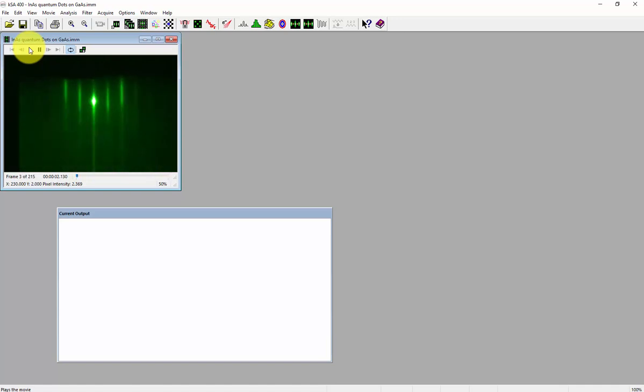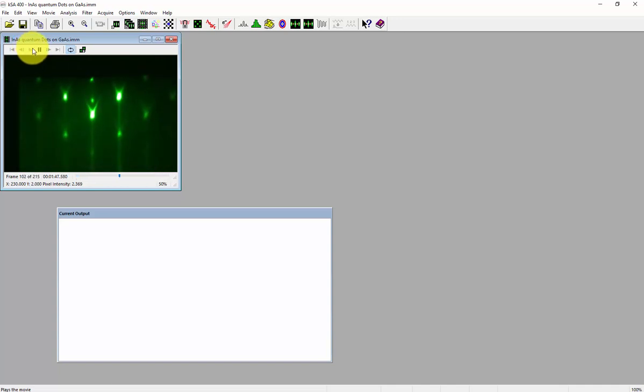First, open the file that you want. Here is a video of indium arsenide quantum dots on gallium arsenide.